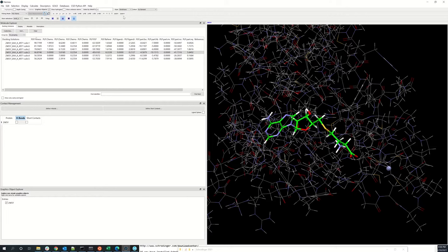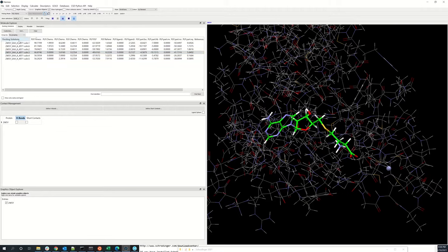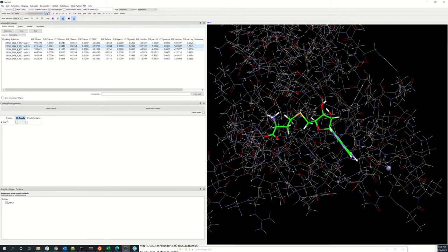Once your docking run is complete, you will see your docked solutions in the docking solutions tab in the Molecule Explorer window. You can click through your docked solutions and they will change in your display area on the right.